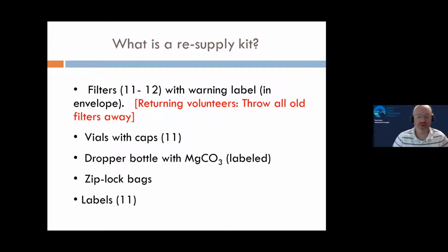For 2021 this year, any returning volunteers who are listening, make sure you throw all your old filters away. Don't reuse your old filters, even if you have established quite a stash of them at this point. The reason for that is that we just noticed some of the old filters were not working properly. So we have gone through a totally new manufacturer to have new filters that should be doing the job as they should. So get rid of those old ones. You don't need them anymore.